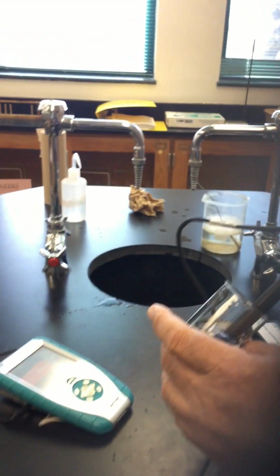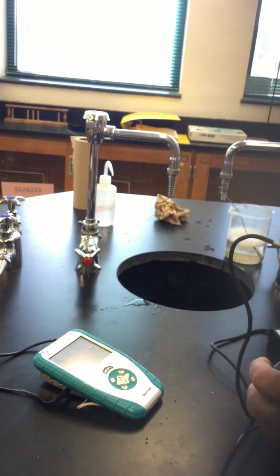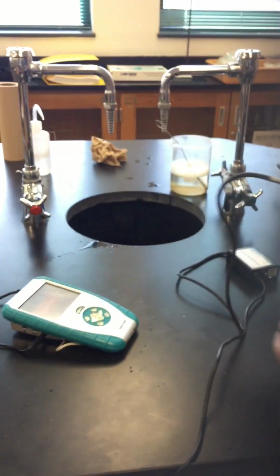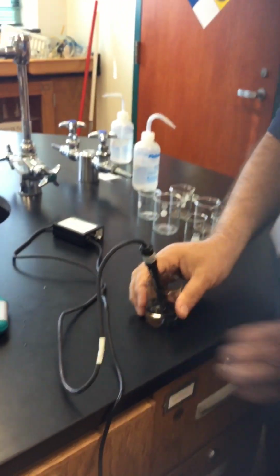So that tells you this has some salt. This is not purified water. There's a difference between purified water and distilled water. So it has a little bit of salt in there, but this is nothing. That's microsiemens per centimeter, the conductivity of the distilled water. I have the students record that in their lab manual, and after they do that, they go to the next item on the table, which is the tap water.